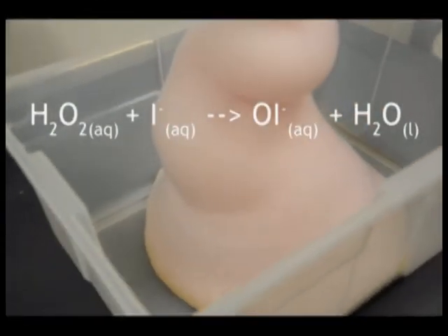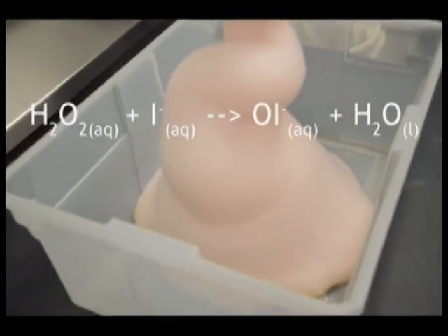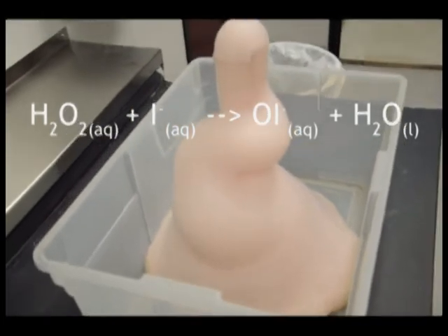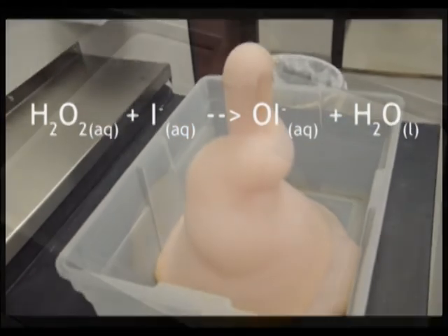So a catalyst is added to speed up the process. Iodine from the potassium iodide bonds with one of the oxygen atoms to form OI- and water.